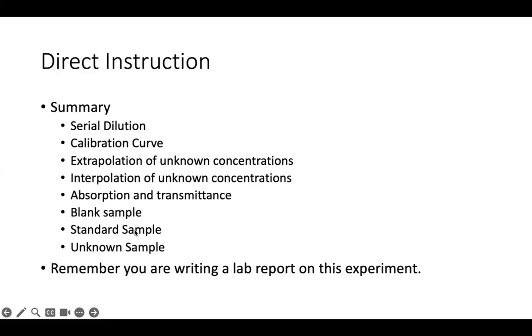Our standard samples are our samples of known concentration. And our unknown samples are what we don't know the concentration of. That's what we are solving for.